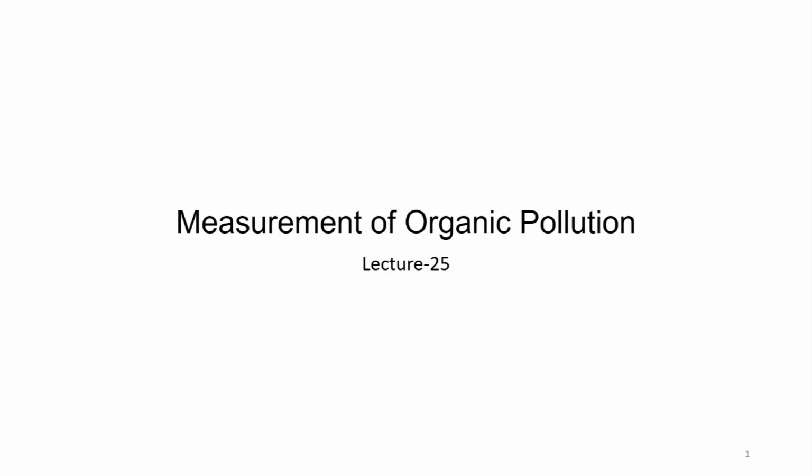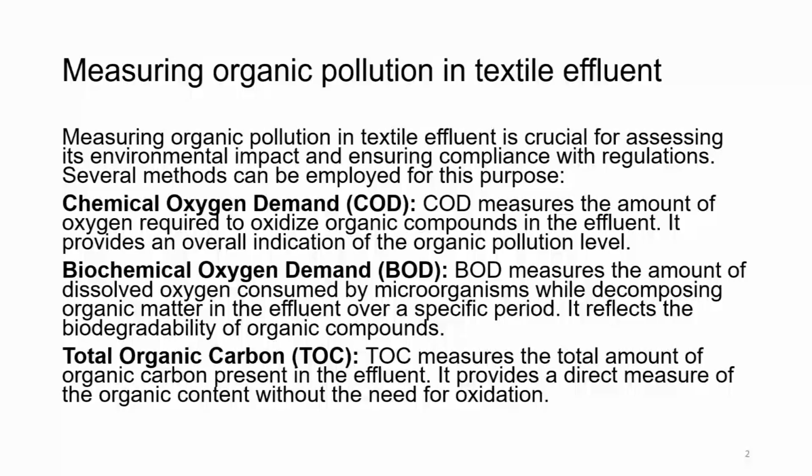Measurement of organic pollution. Lecture number 25. Let us now see, although we had seen how these analyses are done, some new analyses have been incorporated. So, let us go one by one and see how the measuring of organic pollutants in the textile effluent is carried out in the laboratory. Let us try to understand them in more detail.